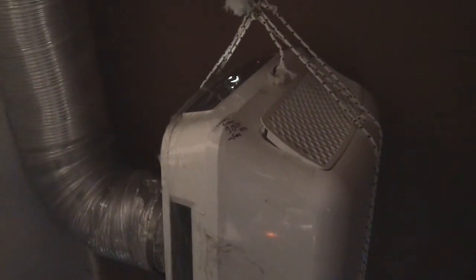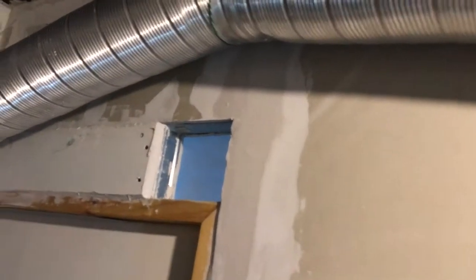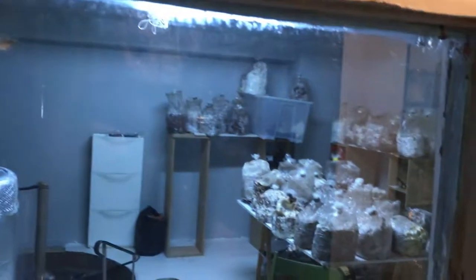It will fill the whole lab with HEPA-clean air, and it will push afterwards through the door — you can see there — through this little square here to go to the incubation room. Most bags are incubating here, but once they are almost done we move them to the other room.